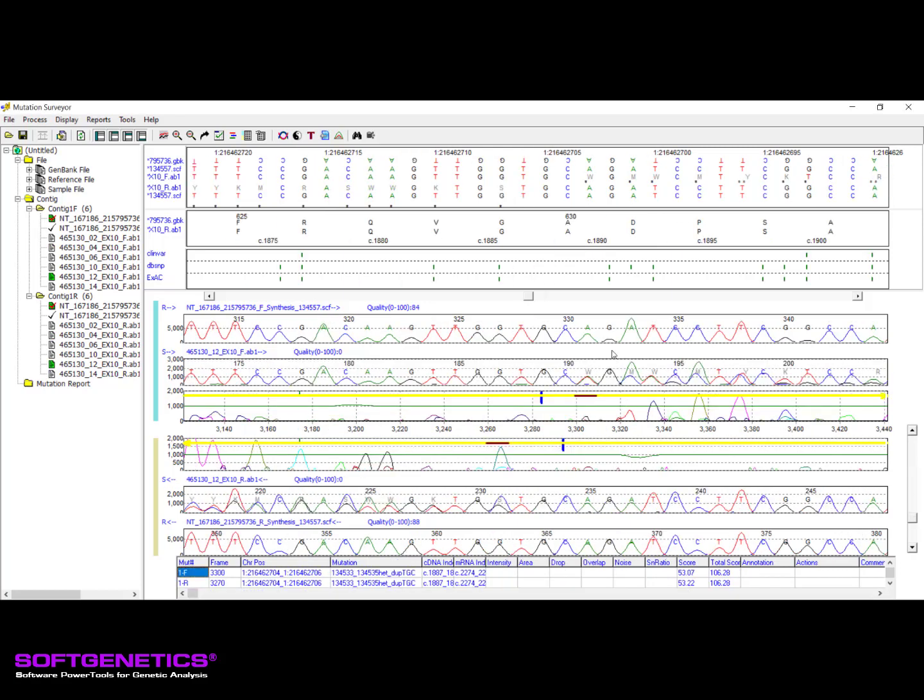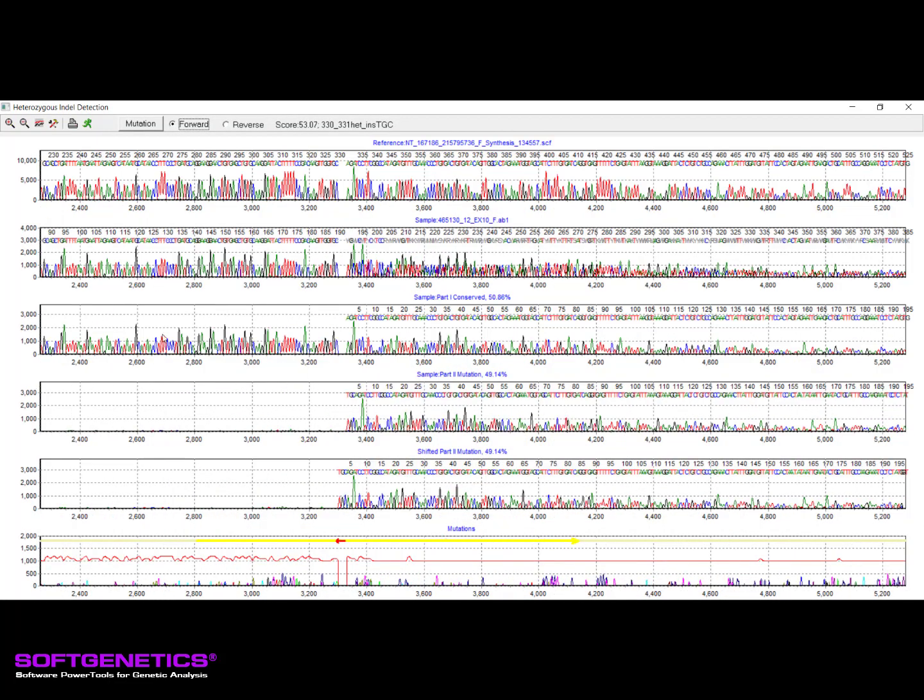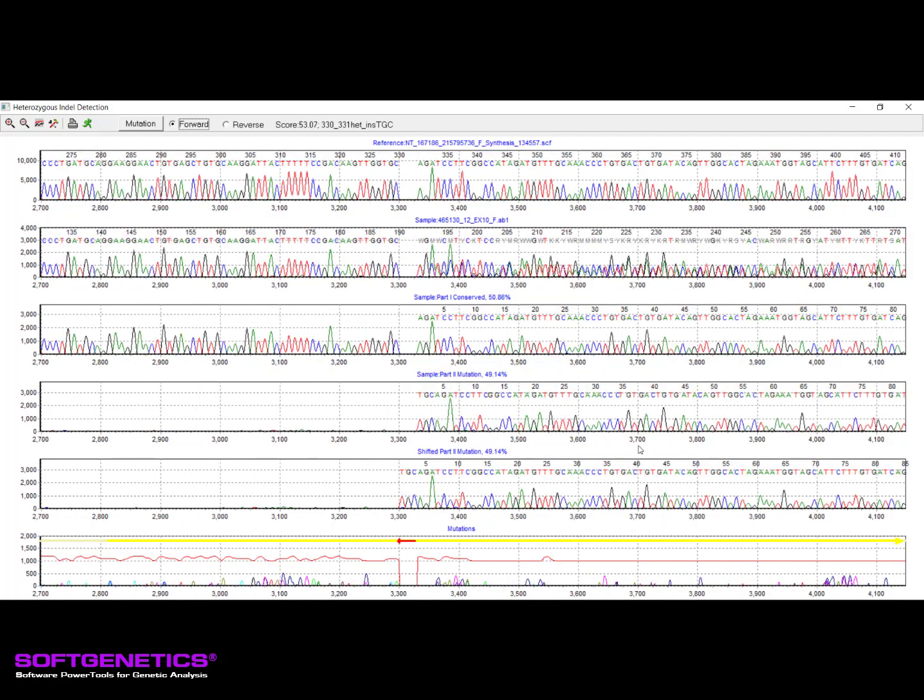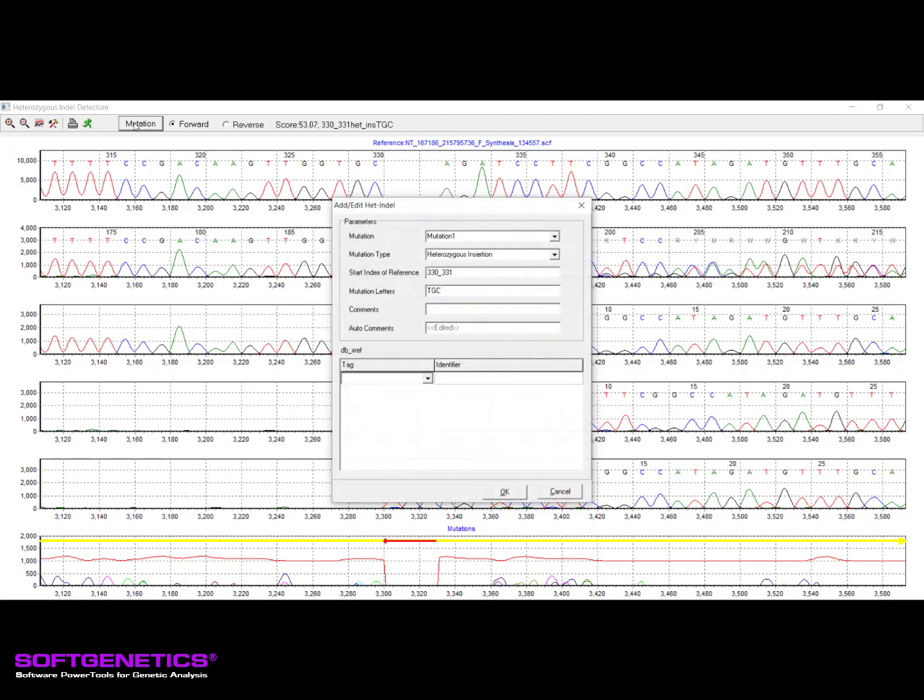Mutation Surveyor has a specialized tool for viewing heterozygous indels called the Heterozygous Indel Detection Tool. This tool, which opens automatically when a Het Indel Call is double-clicked or by clicking the icon on the toolbar, provides a visual representation of allelic deconvolution. This tool can be used to confirm or edit called heterozygous indel events and also add new events. Additional information regarding the usage of this tool can be found by viewing our Het Indel Detection webinar.